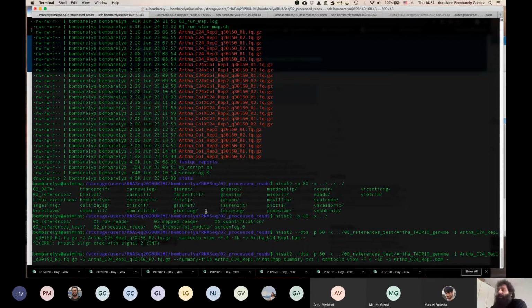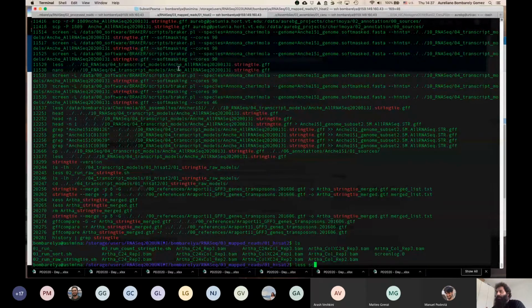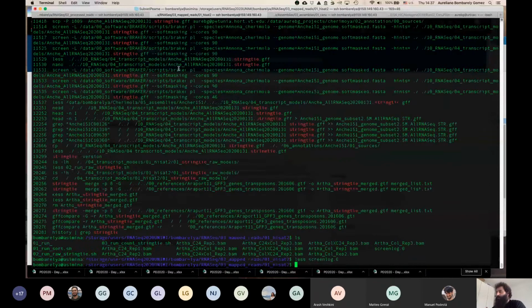I'm running this. I'm going to go to a different window. Okay, and just to be sure, let me check. This is okay. This is running.